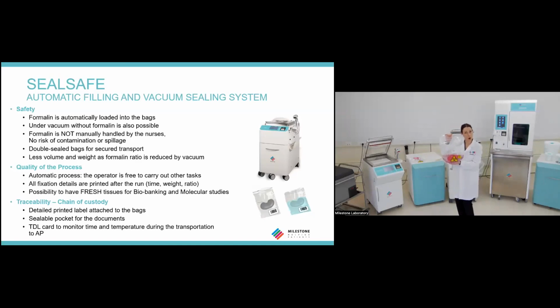At a particular point in SealSafe, after the fluid injection, we apply a standard vacuum that removes the air from the bag. So the tissue will not float in the formalin. The tissue will stay inside the formalin. So in SealSafe, the volume of formalin used is in any case less than the standard way of collection of the specimen.